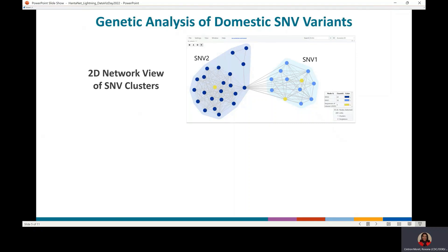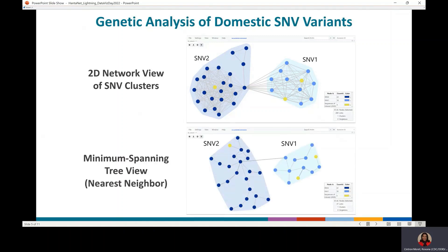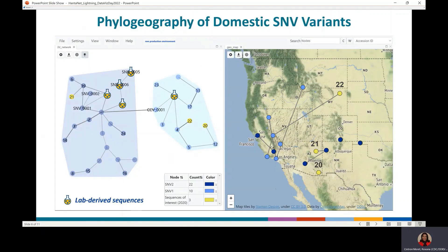Previously, we analyzed the large gene of Sin Nombre virus sequences collected in the United States. We observed two main groups, which we named SNV1 and SNV2. The nearest neighbor algorithm was applied to prune the genetic links to keep the connection between the closest nodes. This is equivalent to the minimum spanning tree, and the link width is proportional to the genetic distance. The yellow nodes represent the sequences of interest, which could be outbreak or new sequences.